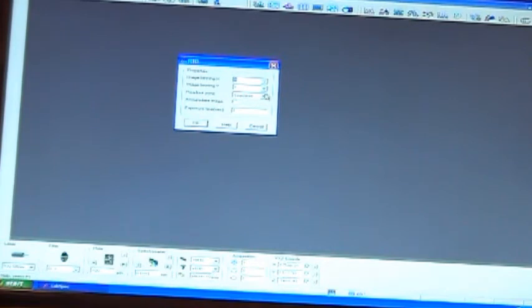Underneath that, we've got a readout zone, either full spectrum or image. For RTD display, we always leave it on the spectrum mode. That is because we have the chip masked down. So any pixels on this CCD chip that do not receive light, we have turned off. Because if they're not receiving data, the only thing they do is generate noise. So to help the signal-to-noise ratio, we shut off all of the pixels that are not getting any light.